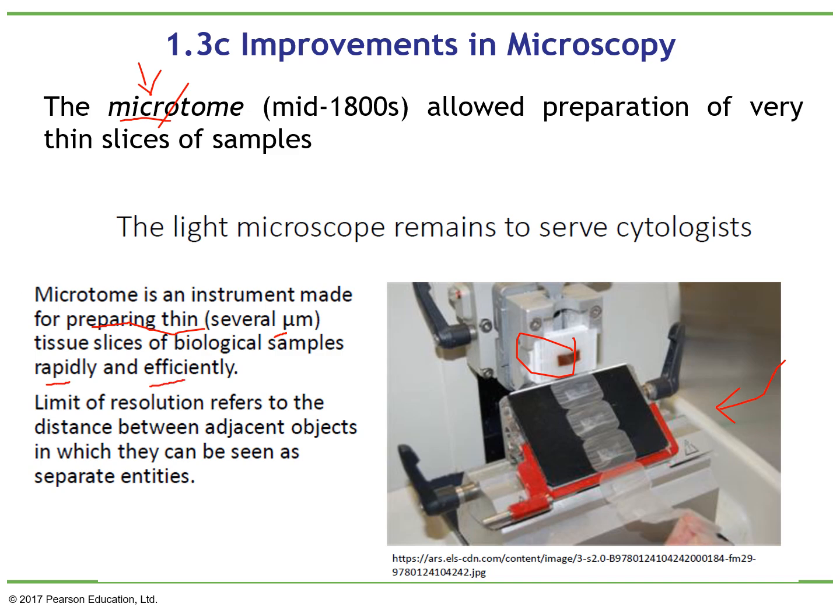Of course, as with any tool, it has some limitations. As we talked about in the previous type of microscopy, the light microscopy, you can do some things, but you cannot do other ones. One limitation is that you are only going to have a resolution of very few micrometers. You cannot make thousands of slices.